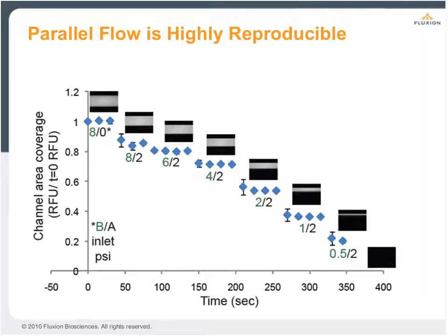in this case. So in this graph, what you can see are the resulting highly reproducible conditions over 14 different channels. And these are measurements of the compartment size that contains the fluorescent dye. What you can see is that the size of the compartment is identical from channel to channel. This is actually a mean flow of 14 different channels.